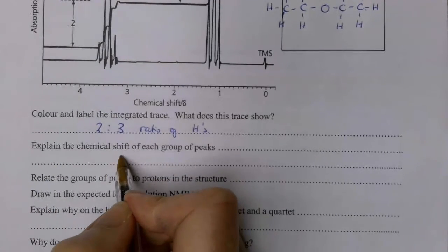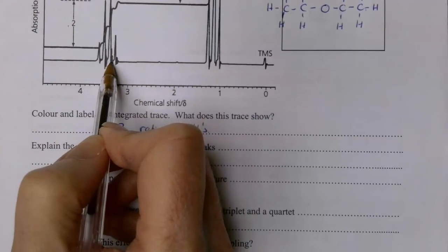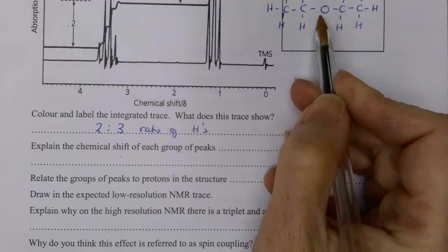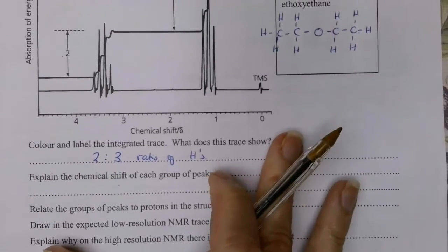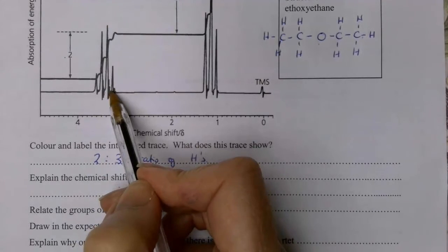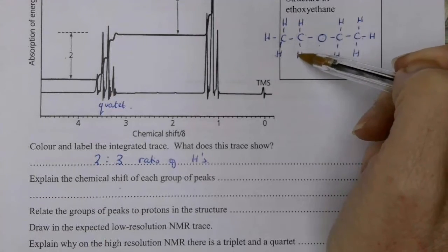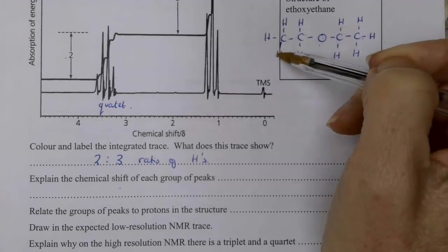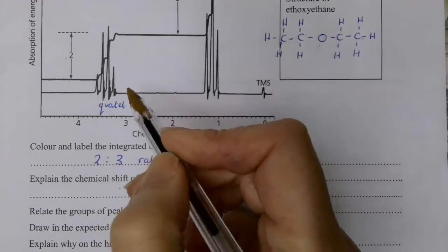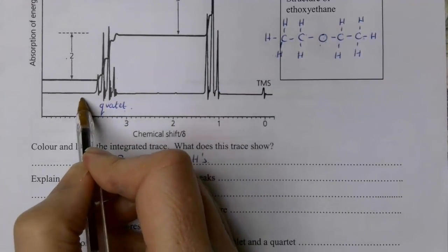So, explain the chemical shifts of each group. Well, this group here is what we call downfield shifted. It's further away from the TMS peak, and that's because it's closer to the electronegative oxygen. So the closer something generally is to a more electronegative group, the more downfield shifted it's going to be. So we're going to start by looking at these 2 hydrogens here. They've got 3 hydrogens on the adjacent carbon, no hydrogens on the oxygen, N+1, that gives me a quartet. They're closest to the oxygen, so that's why they're downfield shifted.